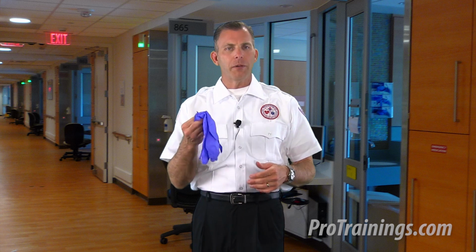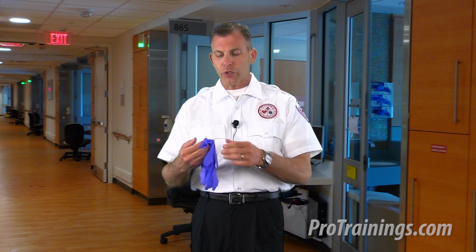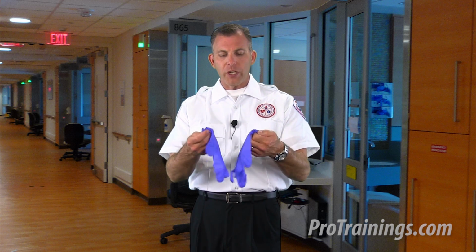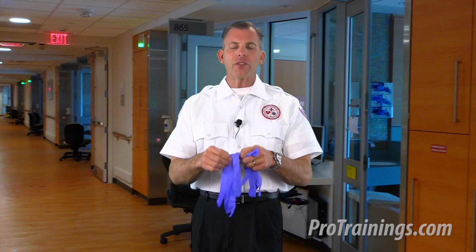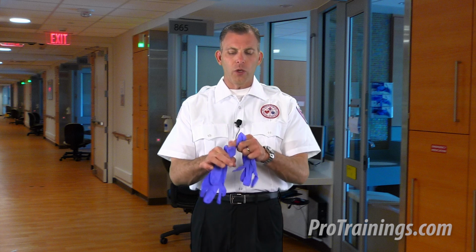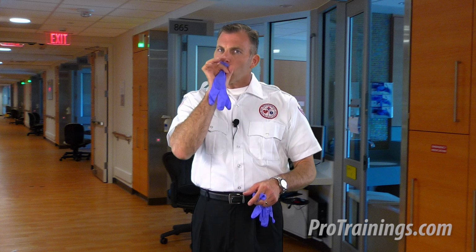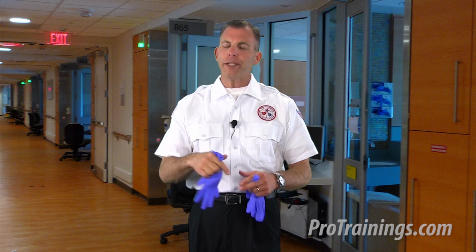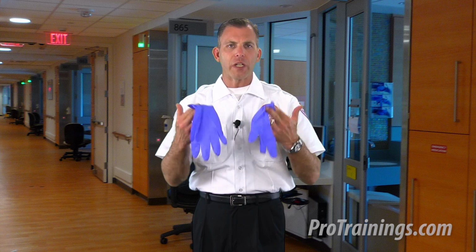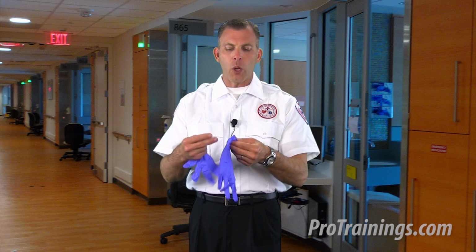This is really becoming more and more common because of so many latex allergies, and so we're using nitrile today. When it comes to putting these on, some of this is kind of common sense. But when I was in EMS school, these guys would stick together sometimes, and so we would kind of blow them up a little bit. Not appropriate. We are not putting our mouths even to supposed clean gloves. We also don't want to get germs on the gloves. So we're not blowing them up.